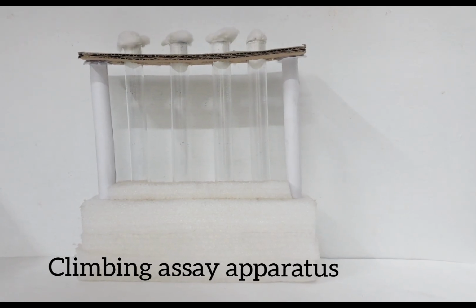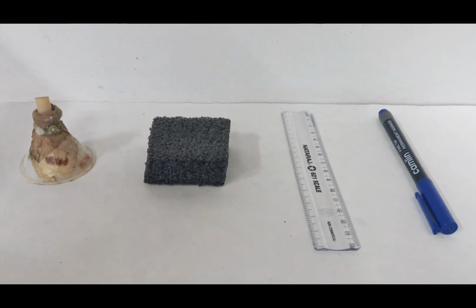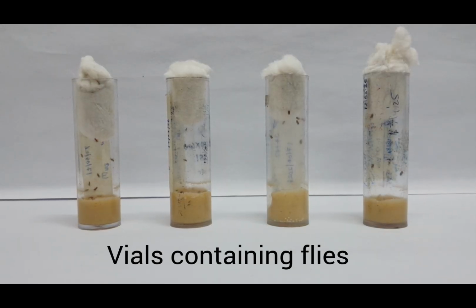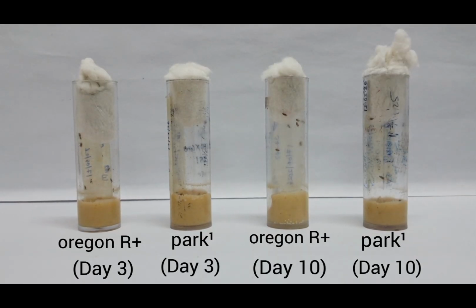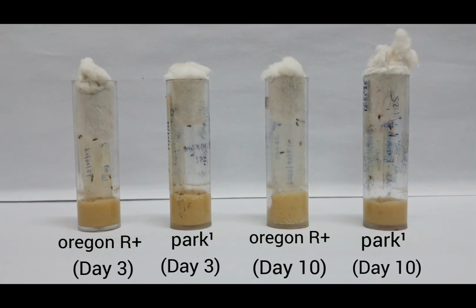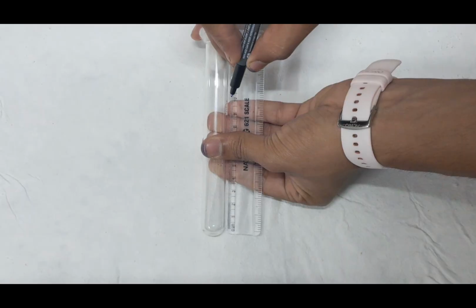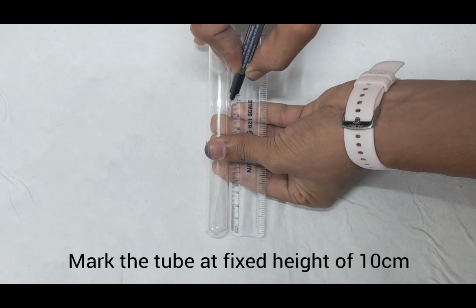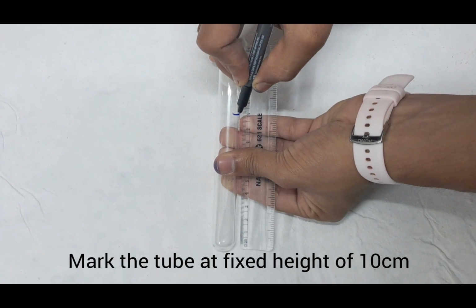For this experiment, required materials are climbing assay apparatus, funnel, foam, ruler, marker, vials containing flies of two different days in which we use Oregon R plus as a control and Park 1 mutant to compare locomotor defect. Before starting the experiment, a ring should be marked on a test tube using marker and ruler at 10 cm height from the bottom.